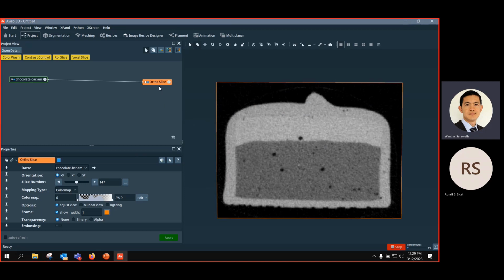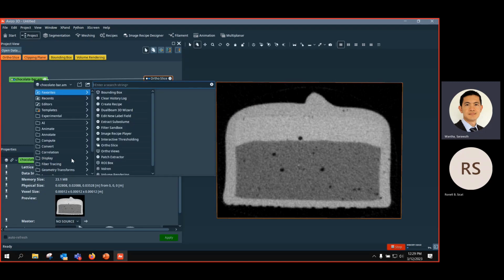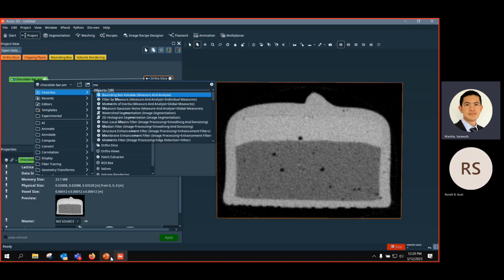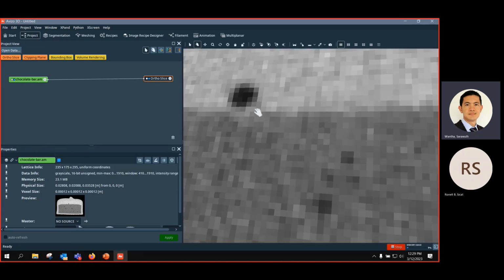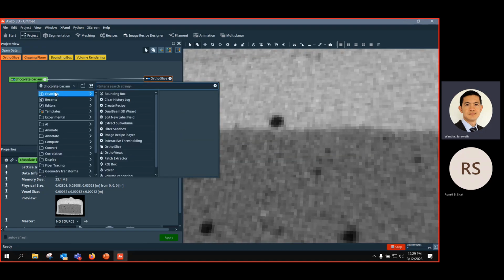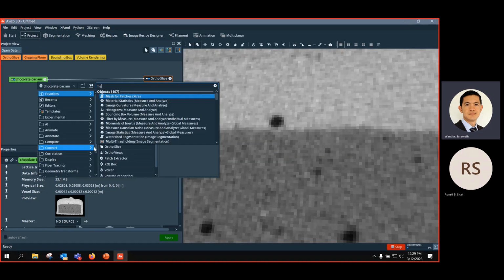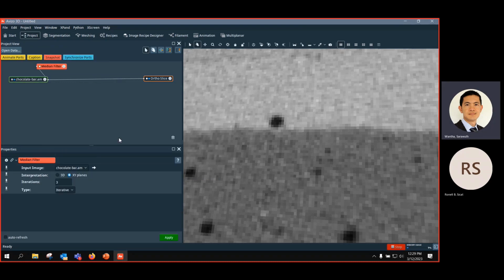We have different types of filters. If you have some experience before, you can use, for example, the median filter, which I know is very quick for this. It's called salt and pepper noise because it's very grainy. Again, if I zoom in quickly, this kind of noise is called salt and pepper. So if I just want to remove this noise, you can easily attach a median filter and activate it.